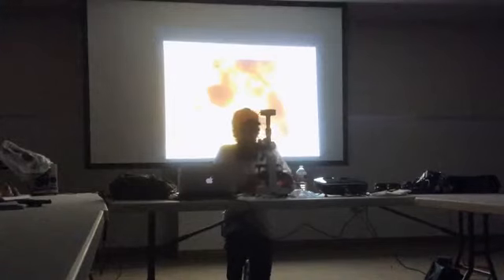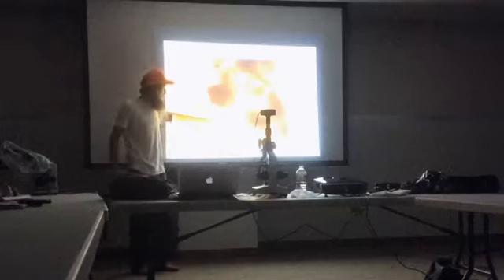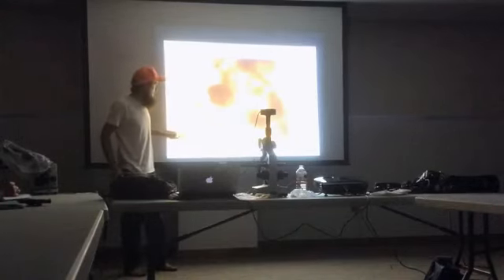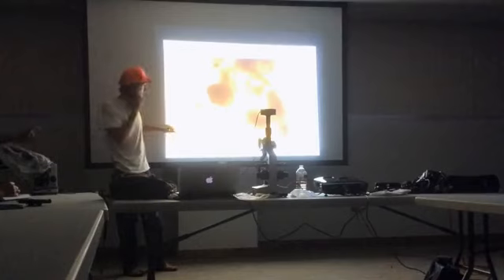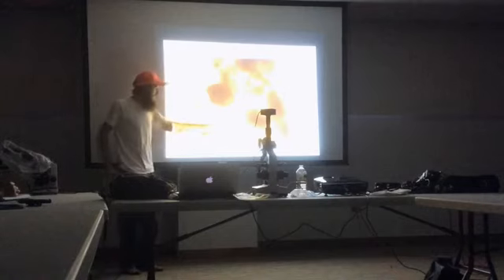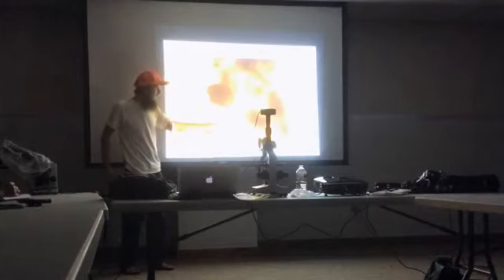So, and then this right here, this is a really nice example of a beneficial fungus. See this dark color, this uniform shape here, all the way through. Hey, Troy, you seen the fungus? Is that little black thing moving around? Yeah. You know what that is? So this is actually kind of perfect. You see how that's one bacteria? So do you see the size of that black dot on there?